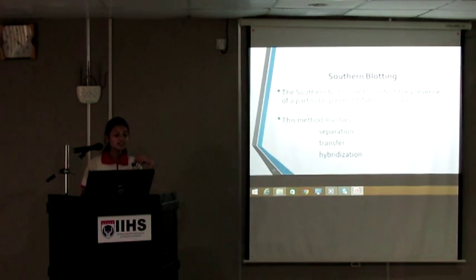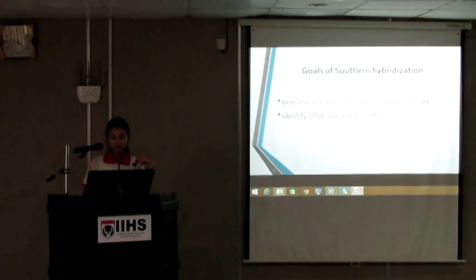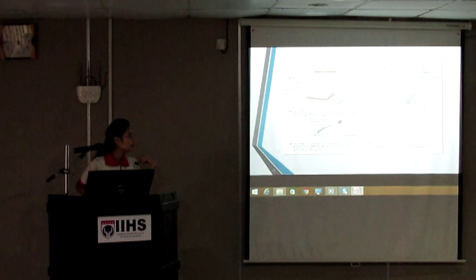This method involves separation, transfer, and hybridization. The goals of hybridization are, first, to immobilize DNA on a permanent substrate, and second, to identify the DNA sequence of interest. And this is the procedure of Southern blotting.